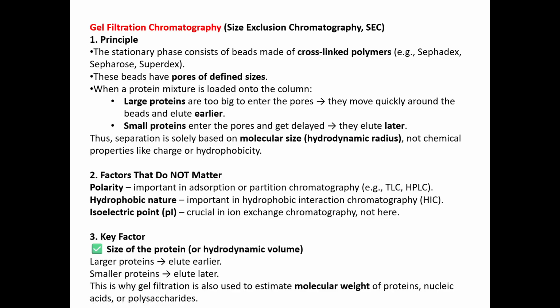So this week it's mostly about gel filtration. Some of the slides might be repetitive, but we'll go through them because we have to go through all the questions. And then in the end, maybe a couple of questions you can answer on your own based on whatever explanation has been given. So, coming to gel filtration chromatography, it is also known as size exclusion chromatography or SEC.